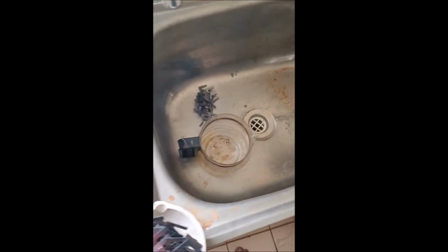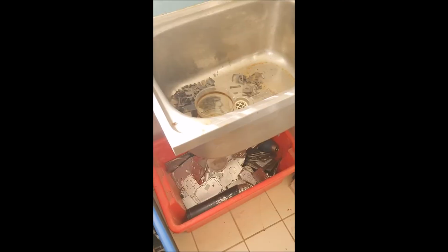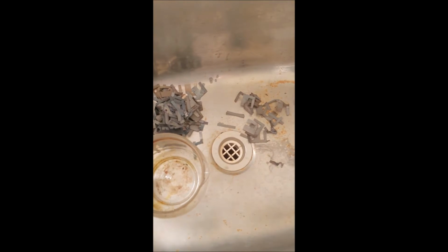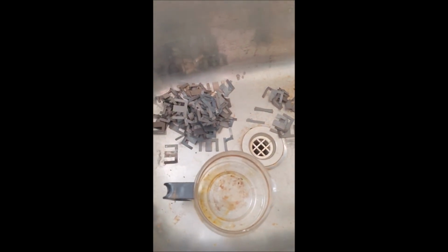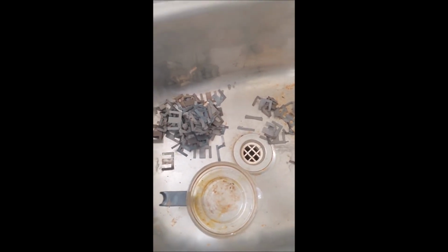Okay, I'll just do the rest of these, save boring you to tears, and then I'll come back. Okay, so I've heated them all up to glowing red. Now I'm just going to give them a quick rinse, and then I'll put them straight into here. You don't want to do this ahead of time, like the morning or the day before, because they'll oxidize and start rusting. You want them just been burnt, rinsed, and then straight into the chemicals. So I'll give them a quick rinse.